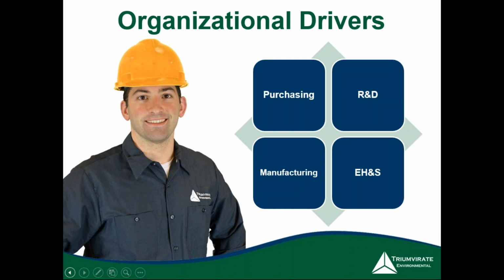And then specifically with R&D, a lot of times researchers are ordering chemicals for specific projects that may be short-term or long-term. If they're shorter term, they may order something that they only use maybe a quarter of a bottle, and if there's another researcher a couple benches down that's doing something similar, a lot of times if they don't know that chemical is already in circulation throughout the department, they can order the chemical separately and use a quarter of the bottle as well.